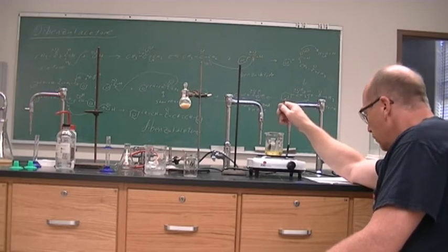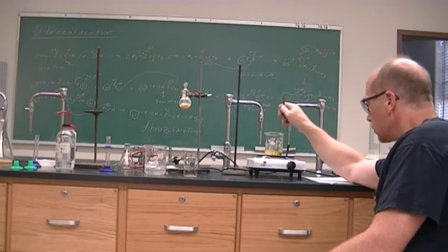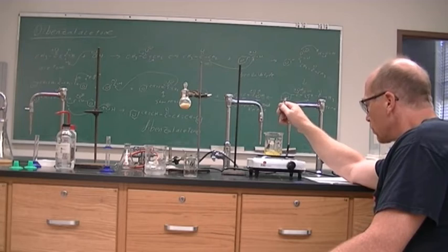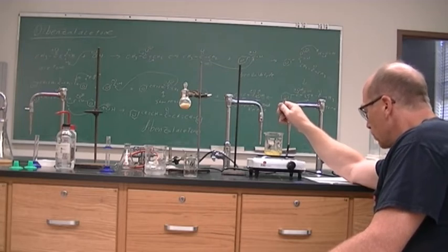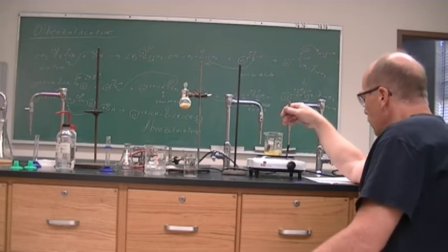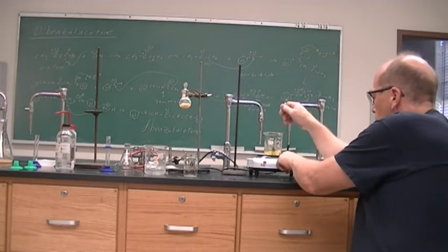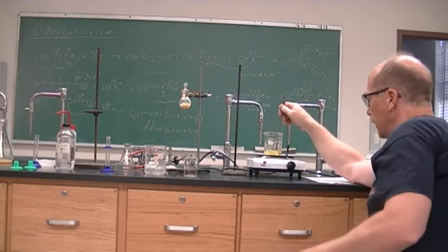So it has all dissolved. So I'm turning the heat off.